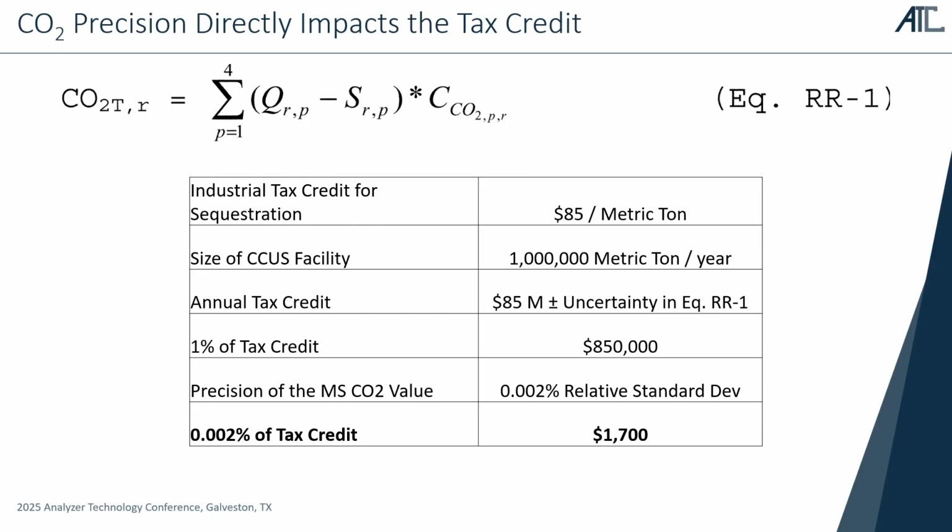Yeah, sure. So first, you can certainly use a GC to do the measurement, and there are those that do. However, there are aspects of any particular carbon capture plant or program where they look at it and there are factors that would point them in the direction of a mass spectrometer. Some examples would be the measurement of the amines and the glycols that I talked about, at ppm level.